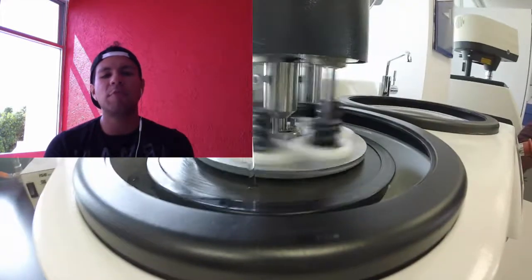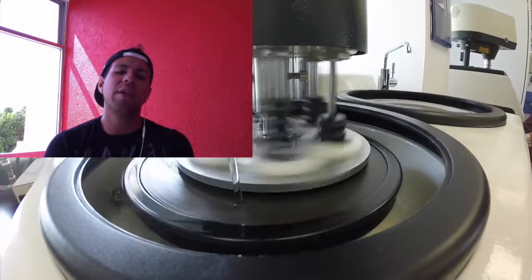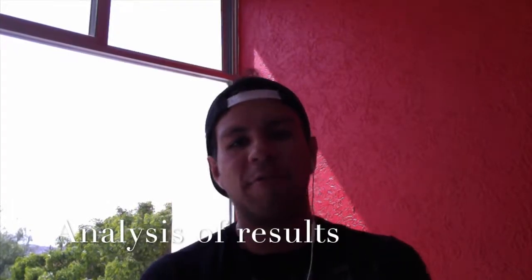The two samples were attacked with the nital. Finally, we proceeded to make the analysis of the samples. The Vickers hardness test was performed on each bakelite. Then an analysis was made in the metallographic microscope with the 100 lens to determine the size of the grains to be able to make the necessary calculations.